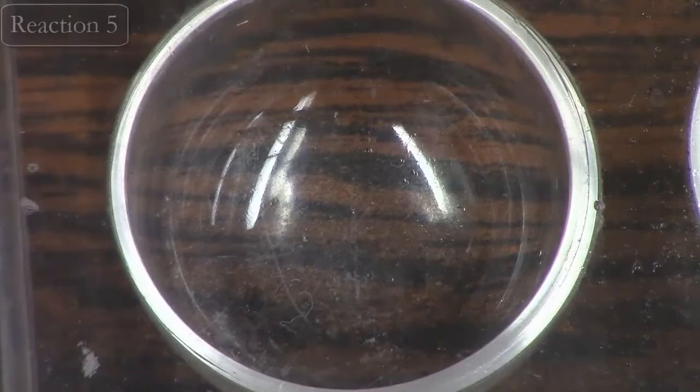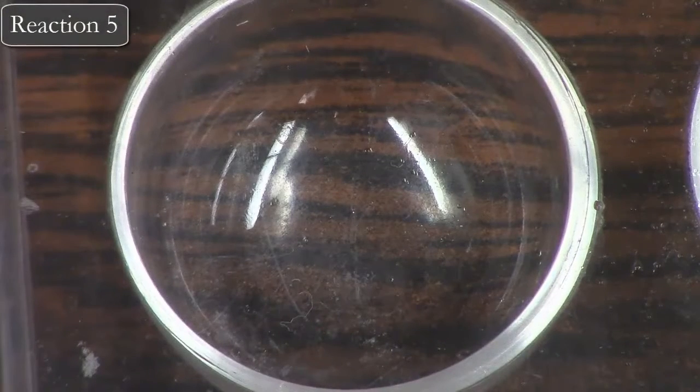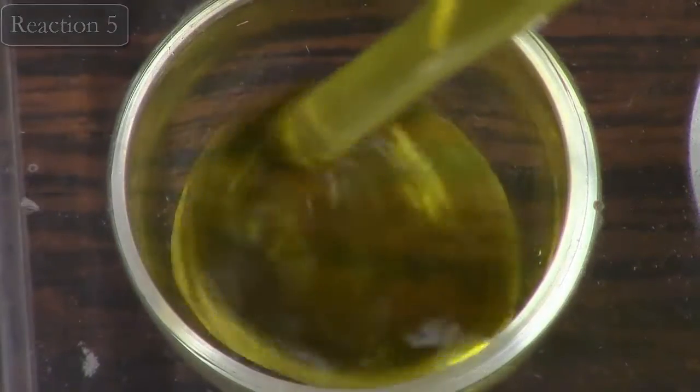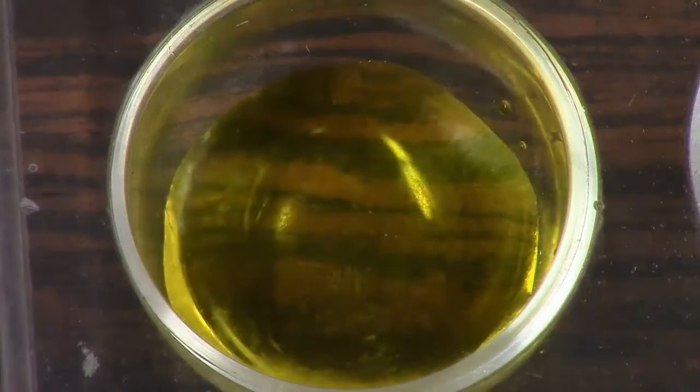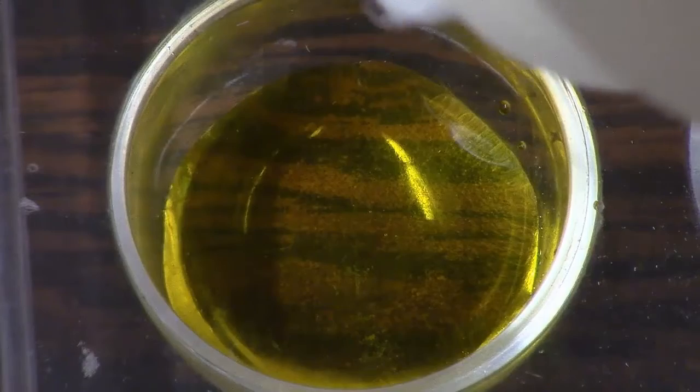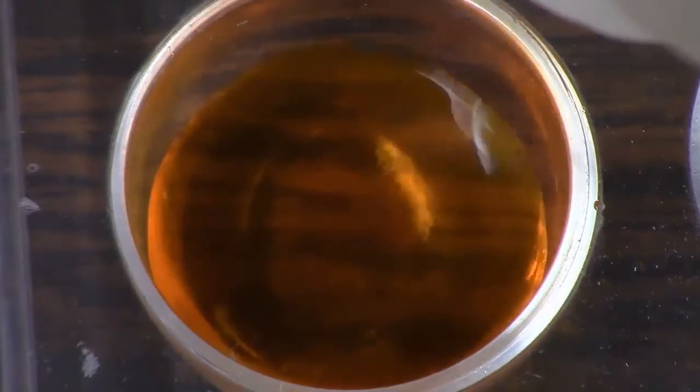All right, now moving on to reaction number 5. So this one, you won't be expected to predict the products of, because it's a little bit complex. So we're going to start off with potassium chromate solution. That's that yellow solution. And then to that same spot in the well plate, we'll add some hydrochloric acid.